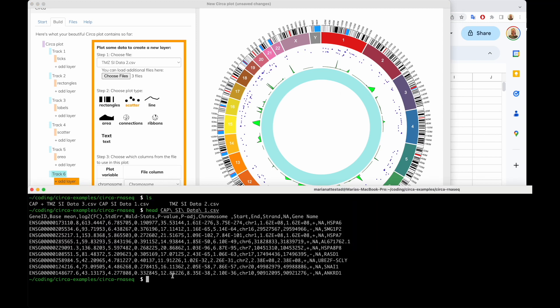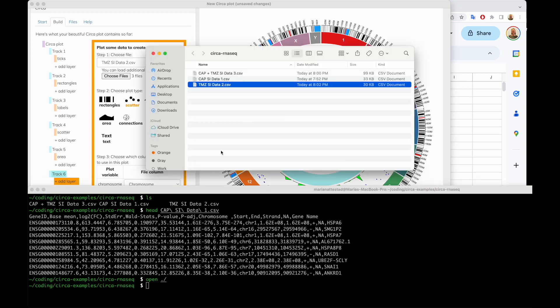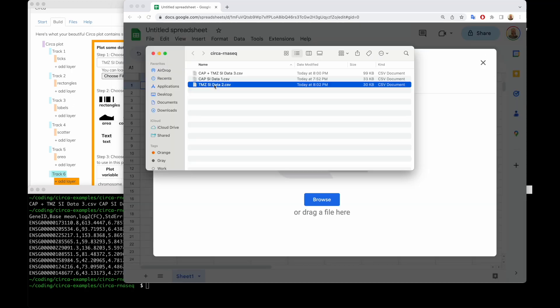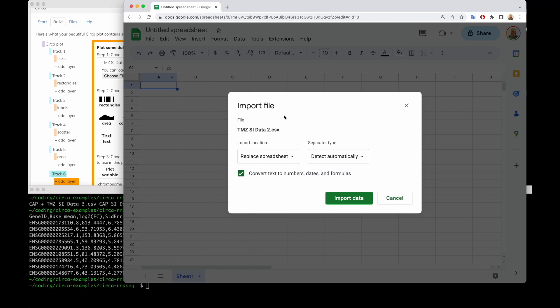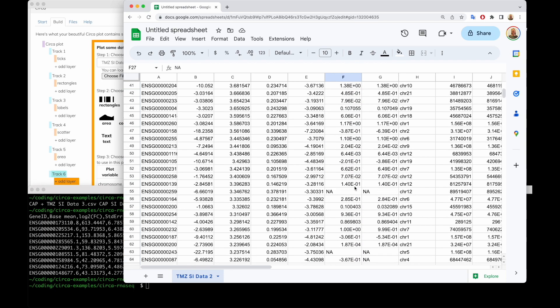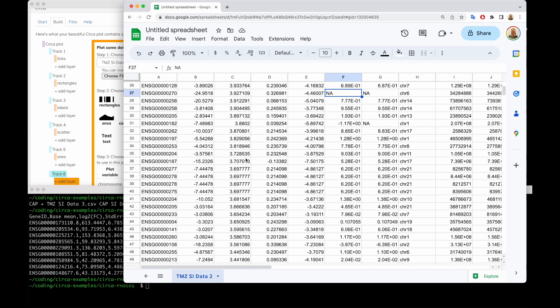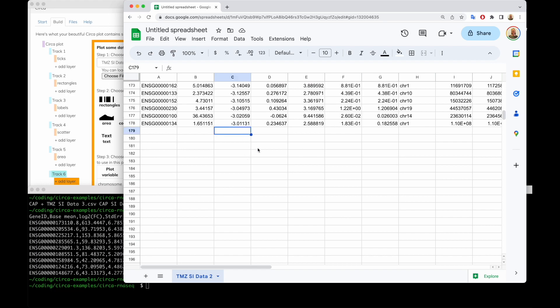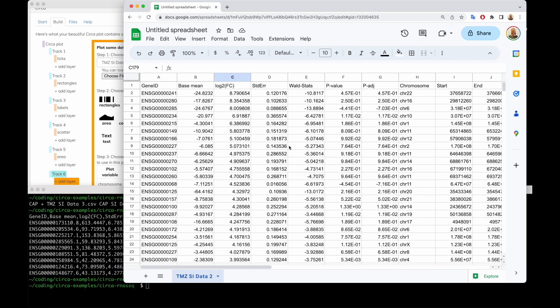Let's pop over and do that. I'm going to open this in Google Sheets and import it here. This is a good way to figure out why the columns seem to not be entirely made up of numbers. It looks like it was the p-value column we were looking at, and there are some NA values in there. It also looks like there might be some issues in general in this file.